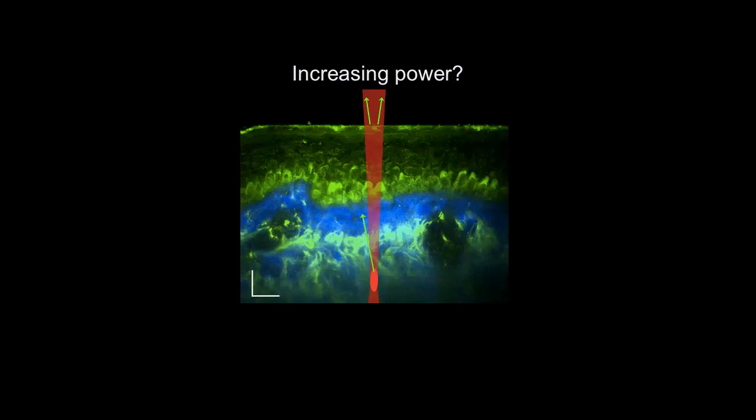I guess with it being in either reflection or transmission mode. So I understand that when fluorescence happens, the photon gets absorbed and the emitted photon can go in any direction. But for second harmonic generation, is that the case? No, that's a coherent signal. I'm sorry, I just didn't have time to touch on all the aspects of this emitted signal.